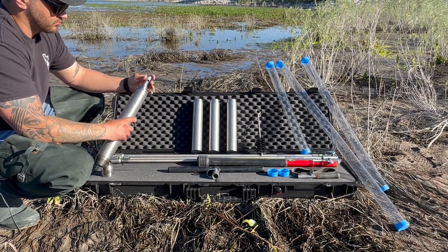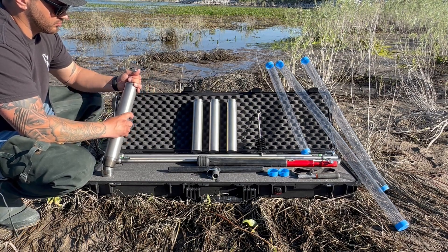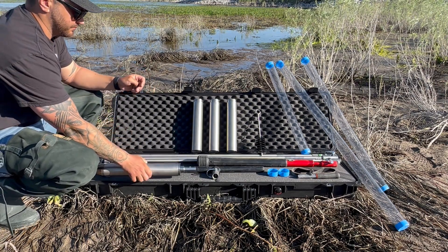Flat valve caps are unique in the way that they allow excess air and water to escape through their four machined holes that open during sample retrieval.